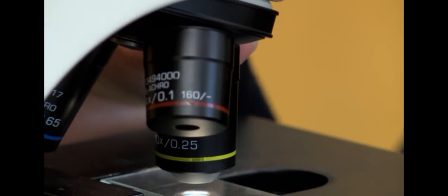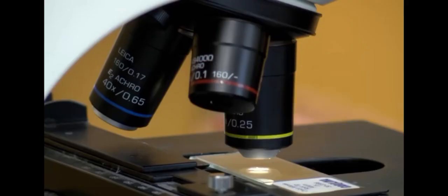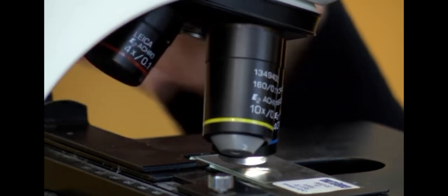Seven. Lower the objective using the coarse control knob until it reaches a stop. Do not force the knob. The stop should be obvious if you are moving the control gently. Again, become familiar with the feel of the position stop.